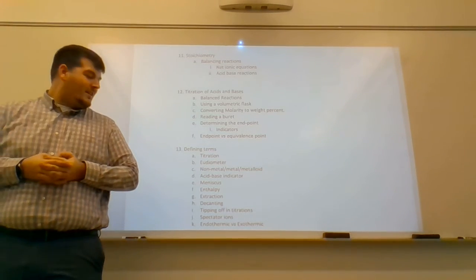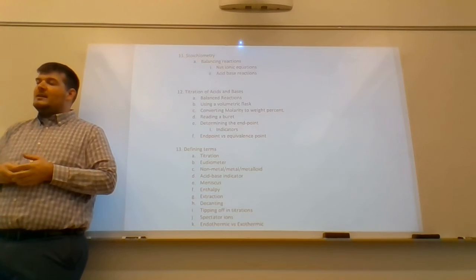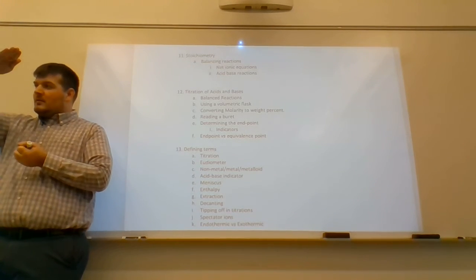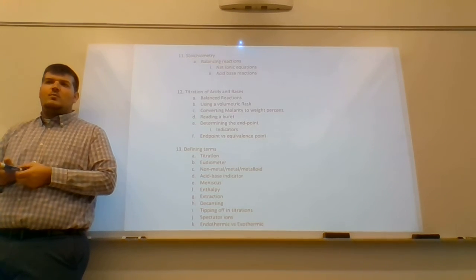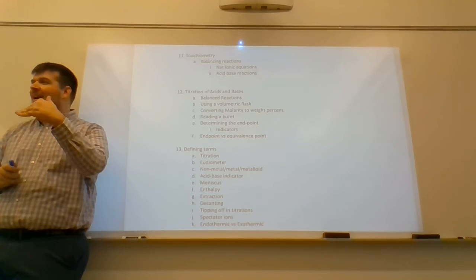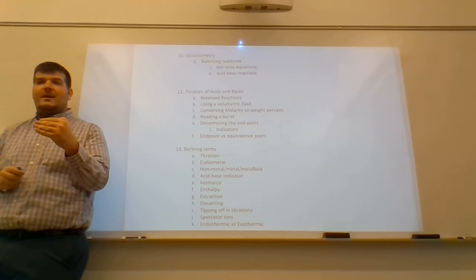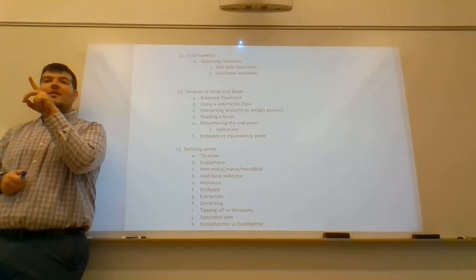I'll say it again. I take 10 grams of oxalic acid, the solid white powder that you guys measured out. I put it into a 250 milliliter volumetric flask. I then add 250 milliliters of water into the volumetric flask. How much solution do I have? 250, more than or less than? More than, because that 10 grams of oxalic acid took up space, right? So really the way that you make it is you take the 10 grams of oxalic acid, you add it in, and then you add water to the mark.